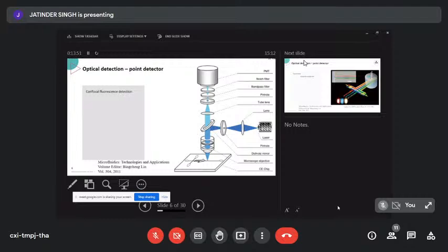With collimator lenses, you just believe that they do what they do, but they keep the light nice and in a straight line, because we don't want a large diffuse detection spot. We want it nice and tidy. So light comes from the laser, gets nicely skimmed off by the pinhole, is reflected down into a focusing lens onto a small part of your chip.